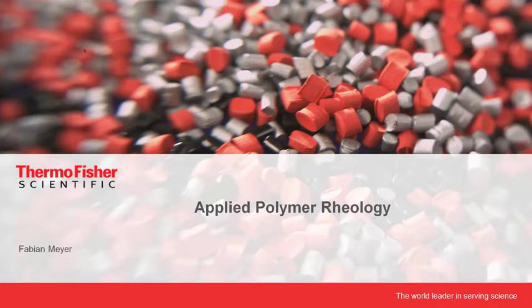In this presentation I will give an overview of common rheological testing methods for polymer melts, solutions, as well as solid samples. Furthermore, the application-related information that can be gained from these tests will be discussed. I will close this presentation with a short overview of different rheometer configurations and accessories specifically for testing polymers.